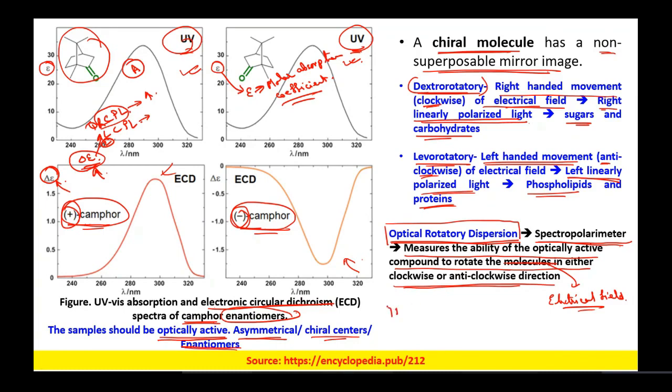So herein you have the radiation source, then you will have the optics. I am not drawing those optics. Excitation optics would be there. Then again over here we will have the polarizer. Then we will have the sample. Now over here we will have the detector.